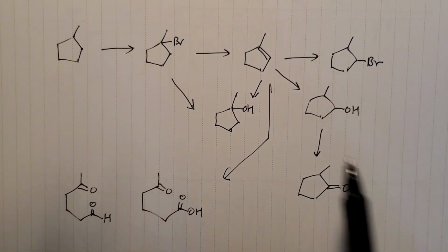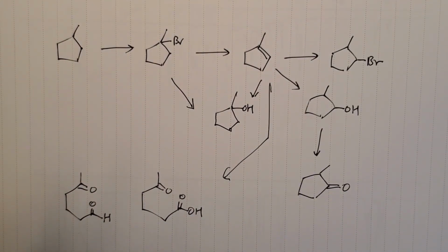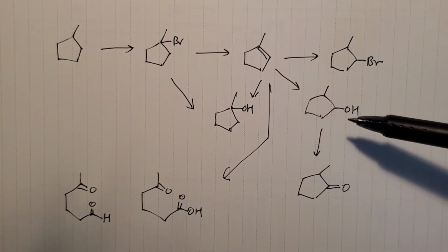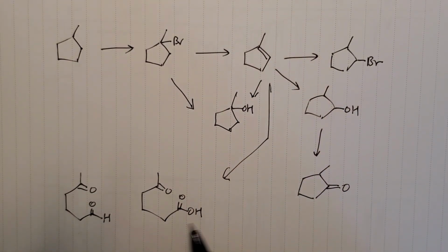And these are the easy ones: strong, broad, intense peak. In the first box, from 4000 to 3000 for OHs, and you cannot tell them apart. And you can get the CO double bond, the typical ketone, so 1715-ish. And if you do ozonolysis completely, you get the maximum oxidation state.